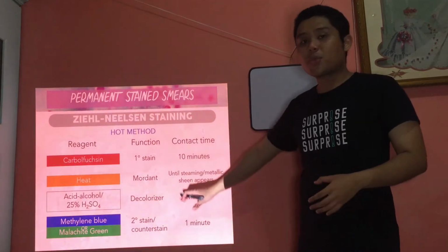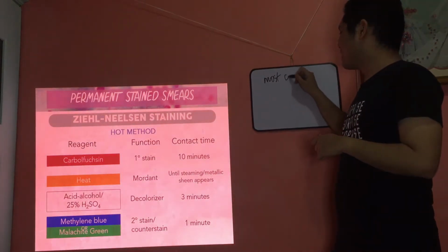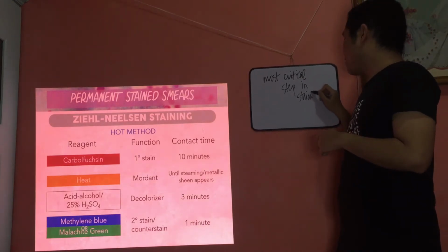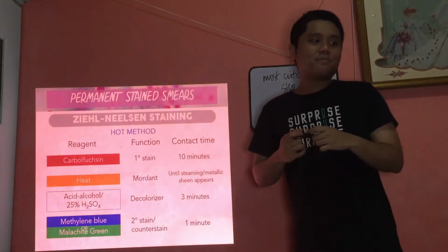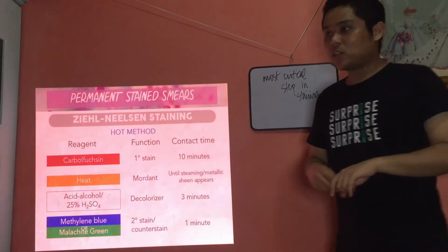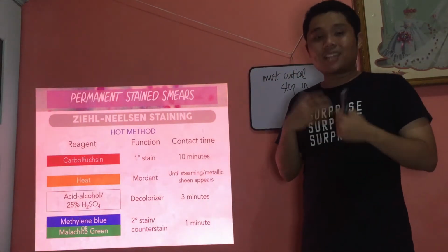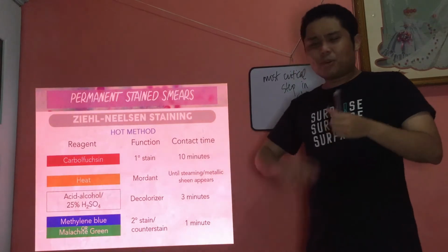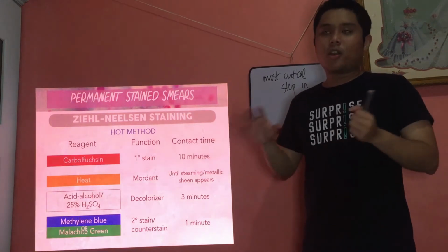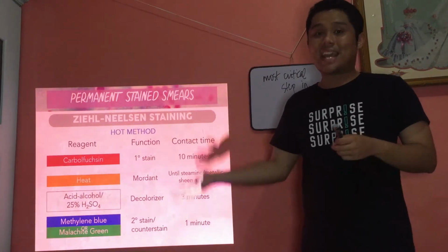This decolorizing stage is considered to be the most critical step. It comes out in the boards. The most critical step in gram staining and acid-fast staining is the decolorizer. Why? Because if there is too much decolorizing, the organism that should have been acid-fast, meaning it was able to retain the carbolfuchsin, will lose it. The carbolfuchsin was washed out because of too much decolorizing. So that will lead to false negative results.